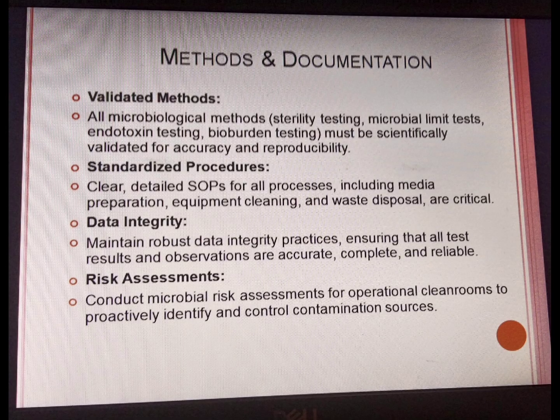Methods and documentation. Validated methods. All microbiological methods, that is sterility testing, microbial limit tests, endotoxin testing, bioburden testing, must be scientifically validated for accuracy and reproducibility. Standardized procedures. Clear, detailed SOPs for all processes including media preparation, equipment cleaning and waste disposal are critical.